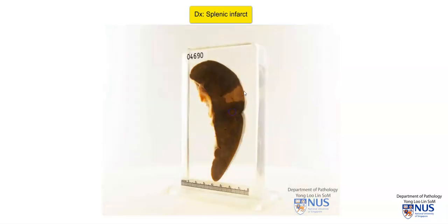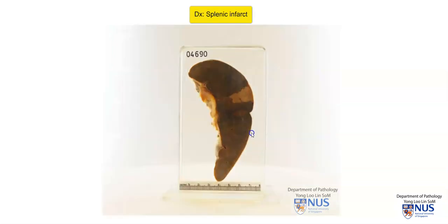Sometimes you may also see some fibrin exudate on the surface, but in this instance it is not well appreciated.